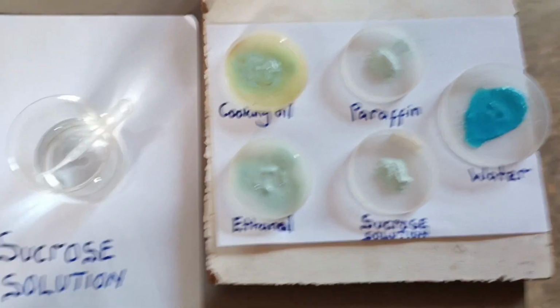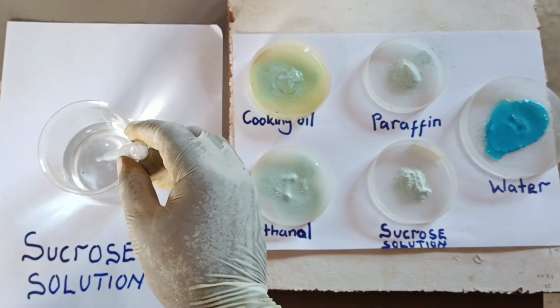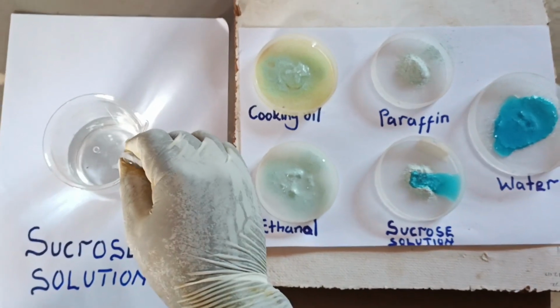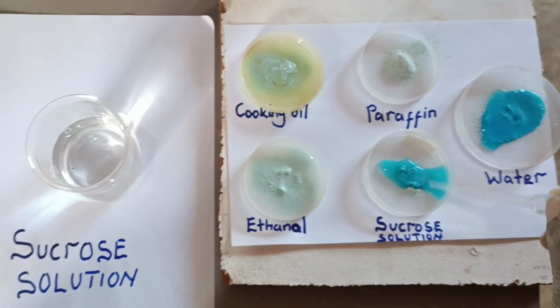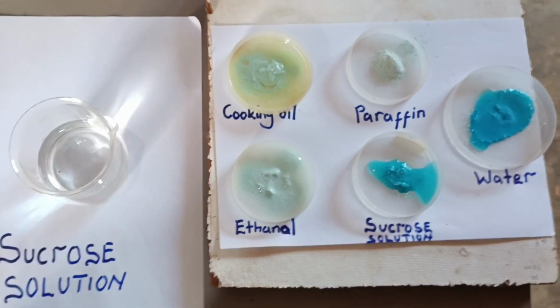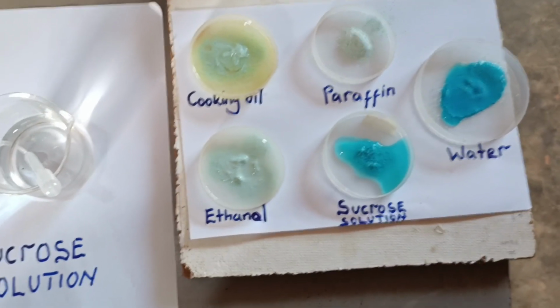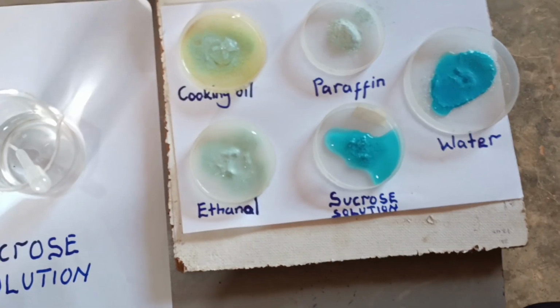Let's move on. Next, we are to add sucrose solution on anhydrous copper 2 sulfate. When sucrose solution is added on anhydrous copper 2 sulfate, the color of anhydrous copper 2 sulfate turns to blue. This implies that in sucrose solution there are traces of water in it.